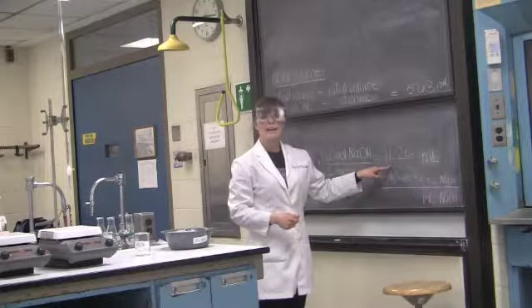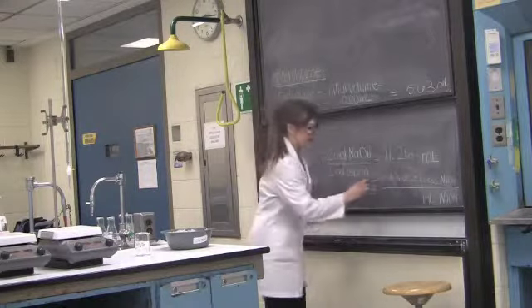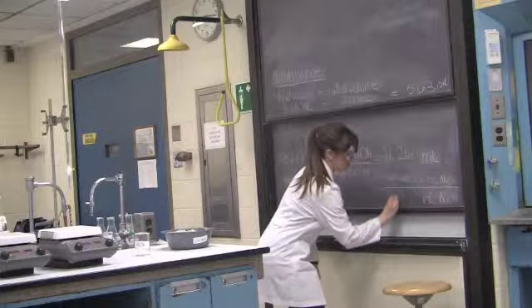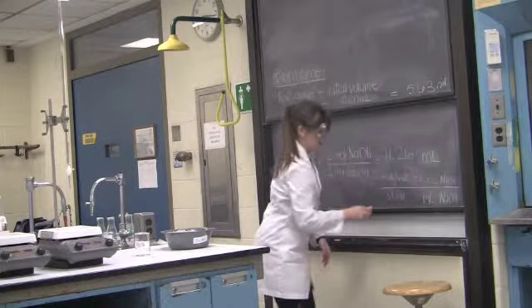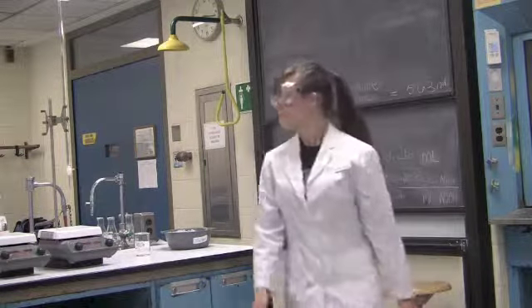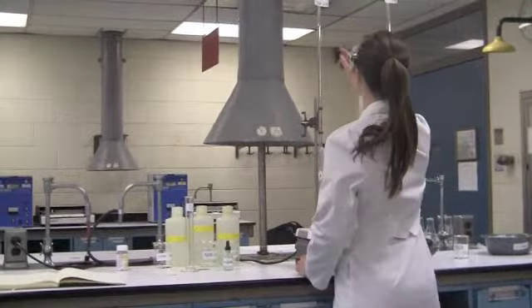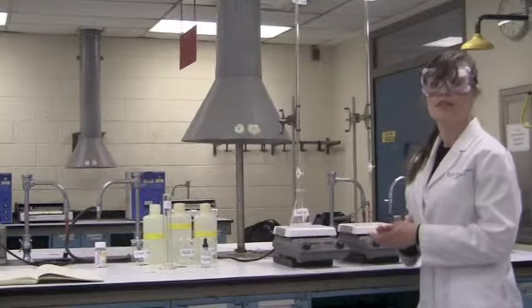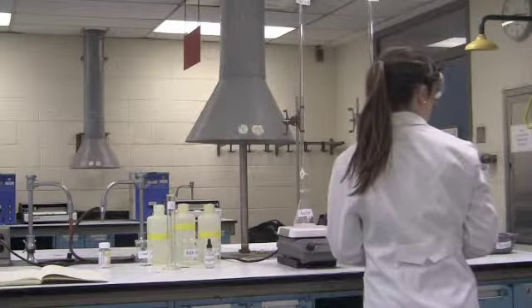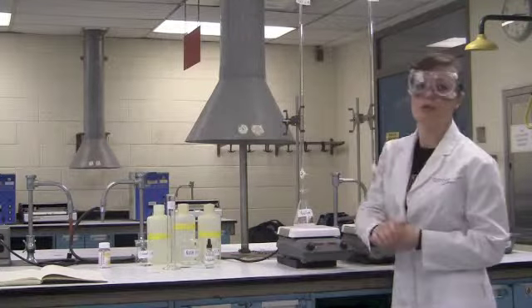We also have to add excess reagent. So we're going to add 10 ml of excess NaOH, and this gives us a total volume of 21.26 ml of NaOH. Taylor will now head over to her beaker to add the excess NaOH. Since we are at a volume of 5.63 ml, we are going to make sure we add it so that we have 21.26 ml. So I'm going to take the volume all the way down to 21.26 ml.